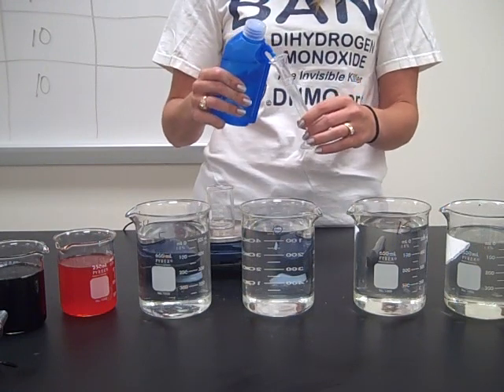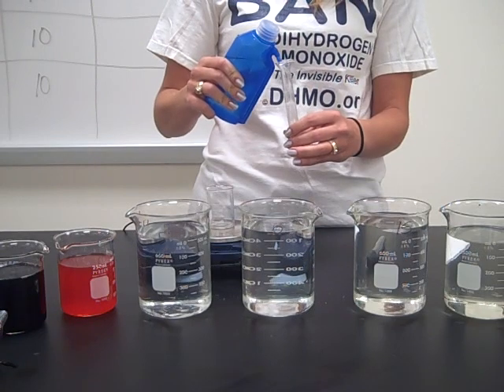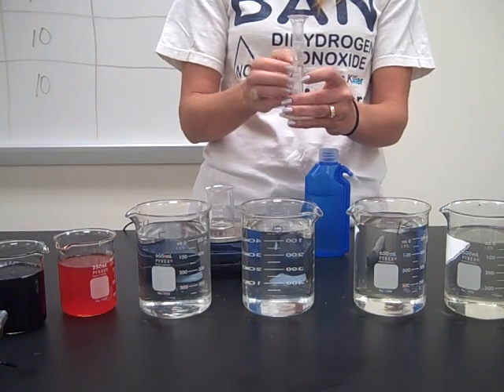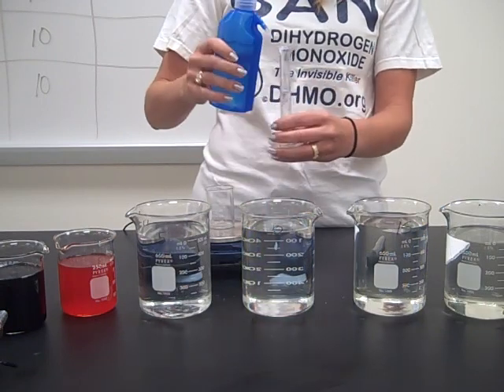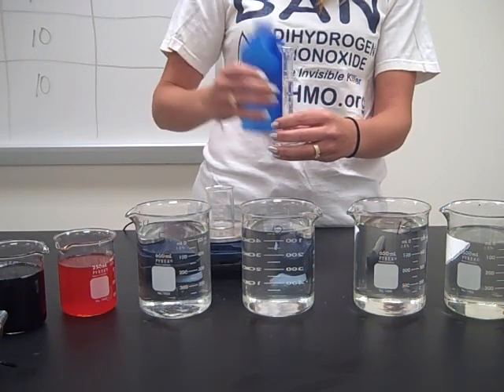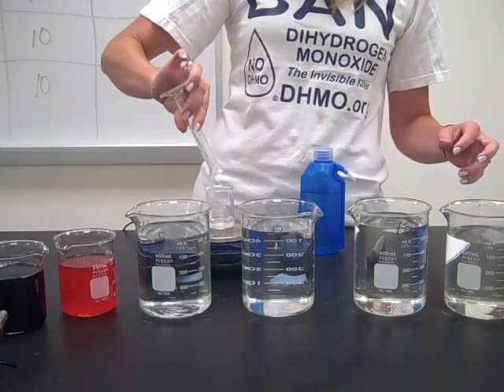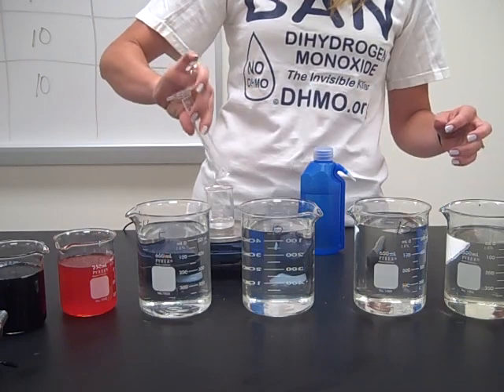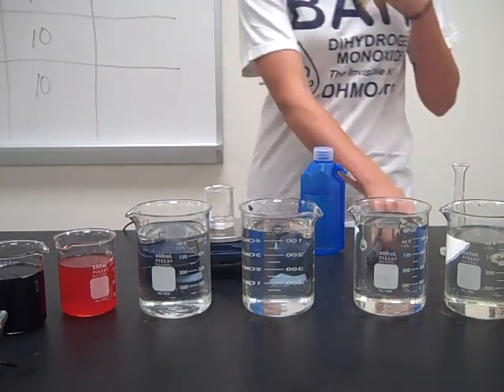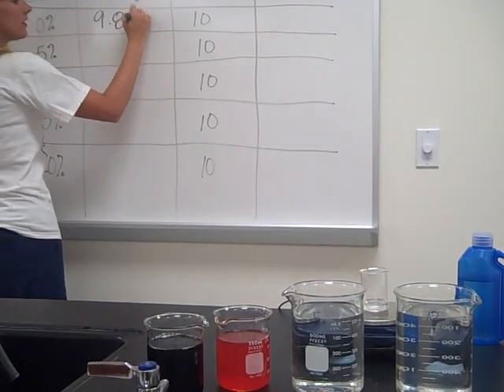Anything that saves me time is a good thing. I'm just going to fill this up with 10 milliliters. Knock some of those bubbles loose — they're not going to come loose, so we'll be a little bit off, a little lower than we should be in our measurements. But it should be fine. Here's 10 milliliters of distilled water, and that 10 milliliters has a mass of 9.87 grams. So we're going to put that into our table right over here: 9.87 grams.